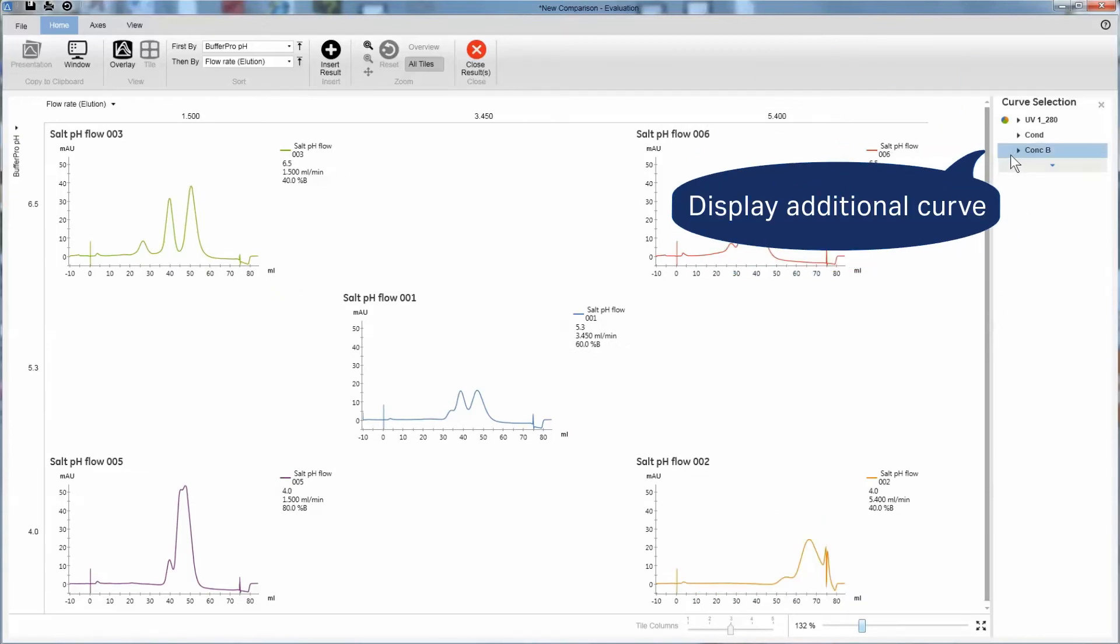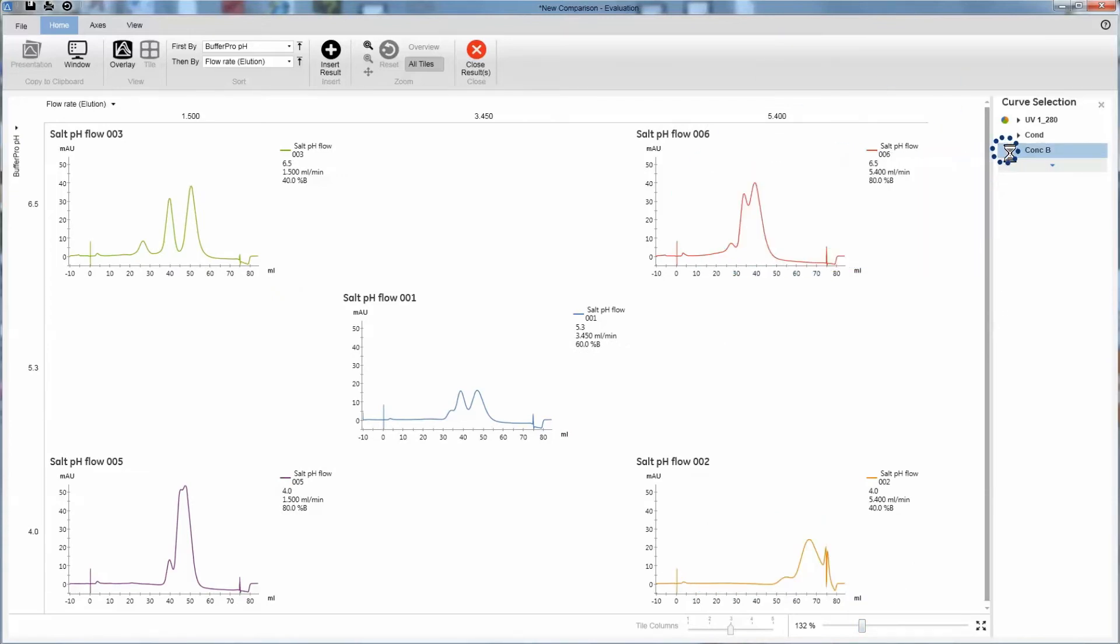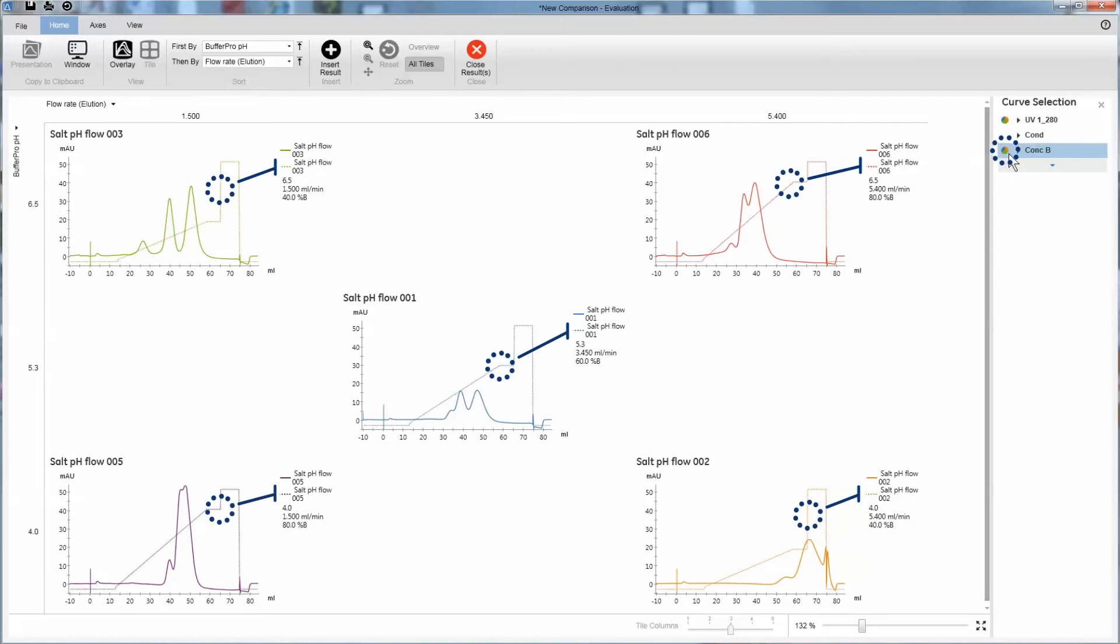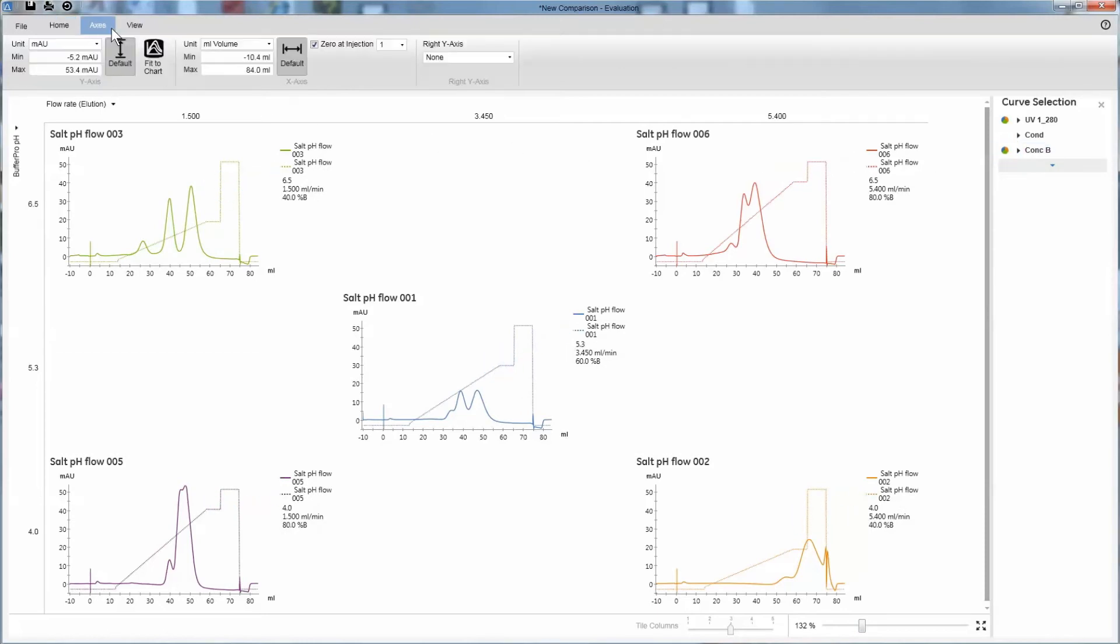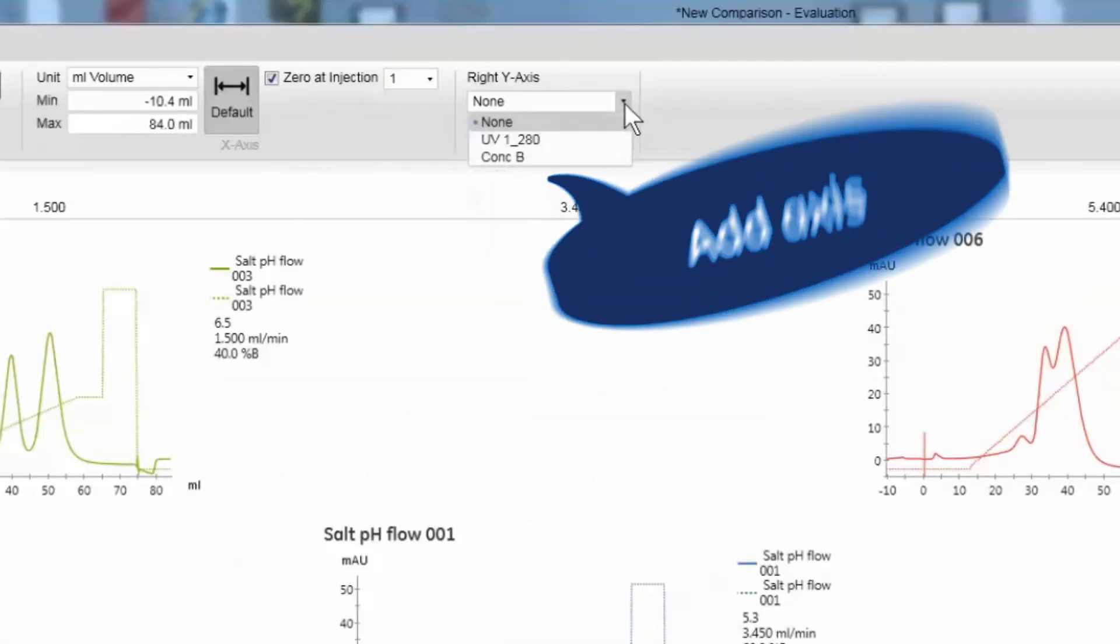To see the gradient profile, you can display the concentration B curve. You can also add it to a second Y axis.